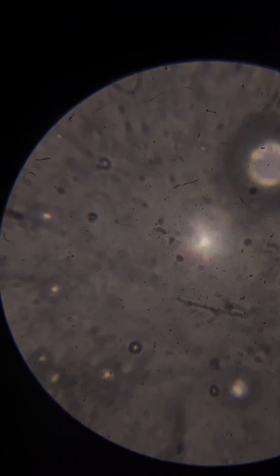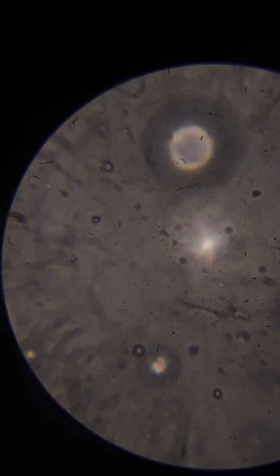This is 600 magnification. Sometimes it's difficult; the higher the magnification, the more difficult it is to watch stuff, but maybe we'll be able to focus. So okay, this is okay. We see stuff. What you can do with 600 again is touch the glass with the lens and then create flow. Let's do it.